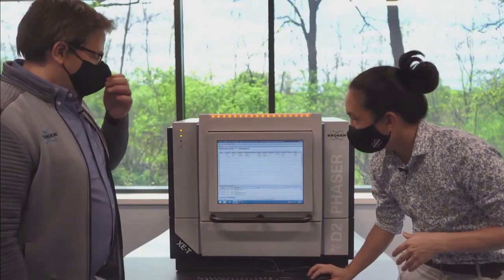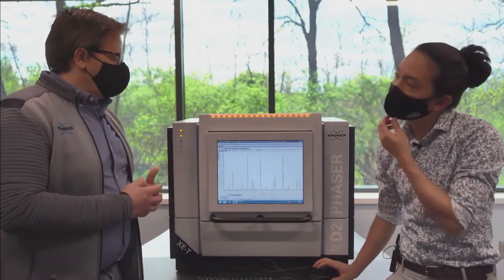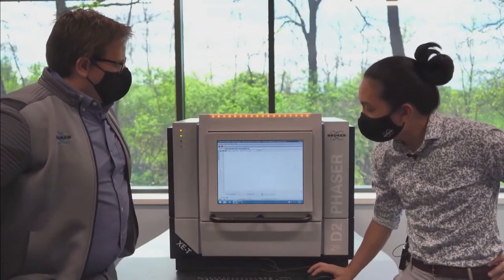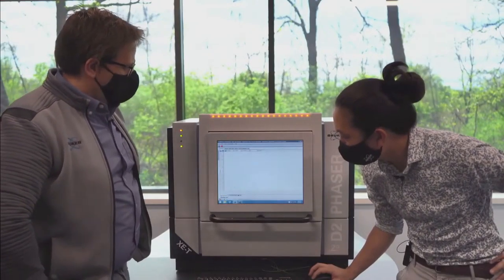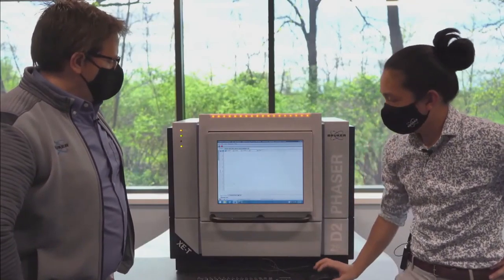Okay. So before we talk a little bit about eV energies of the different wavelengths and things like that. So this is similar to having like 1,000 eV or so. Right. So we know that the K-beta is going to be on the higher end. Yep. So that peak right there at 25 is the peak that we're looking for. Okay. We want to get rid of all that stuff below it. All those extra peaks.